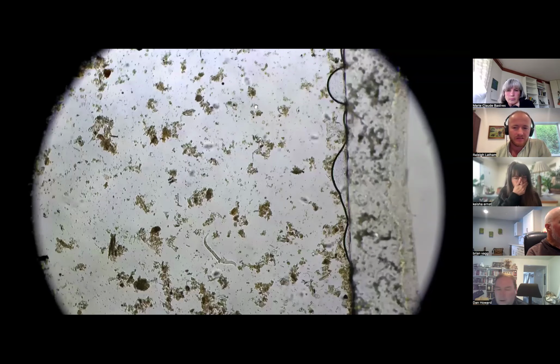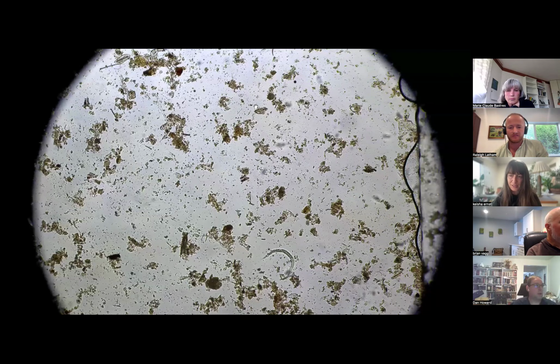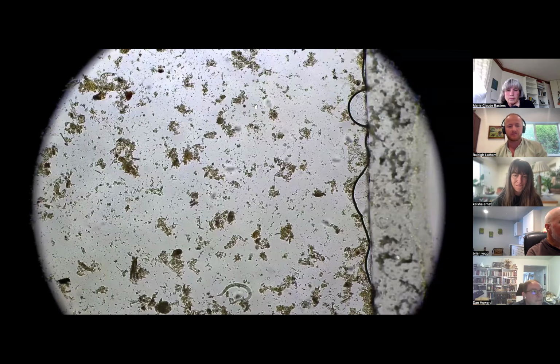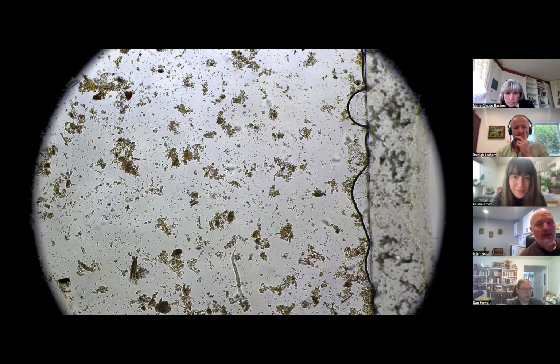Geez, what a wild sample. That's great. I'm really happy with the way my vermicompost is coming out. It's got a lot of life. And in fact, if you look here, I'm not sure if you can see it well enough in the 100X, but there's a lot of flagellates that are moving around. Tremendous amount. You can see them all kind of right in through here. This sample is just chock full of flagellates. Right now, I'm at a 100X total magnification, just so you guys know.